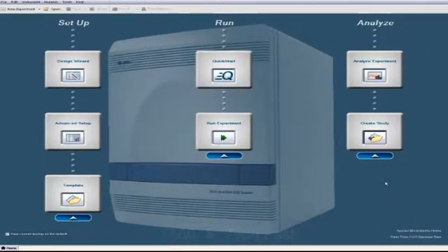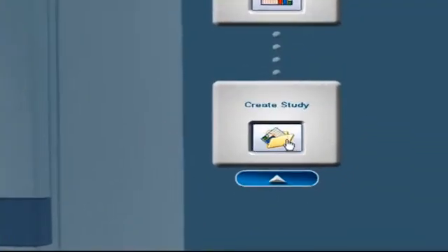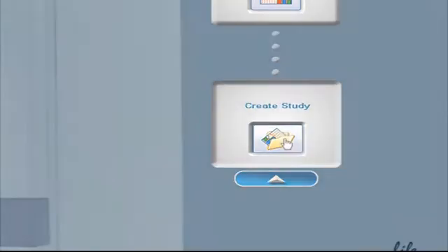The Step 1 and 7500 line of instruments work the same. The only noteworthy difference is that, from the home screen, you'll start by clicking on Create Study. Unlike VS7, the Step 1, and 7500 platforms.